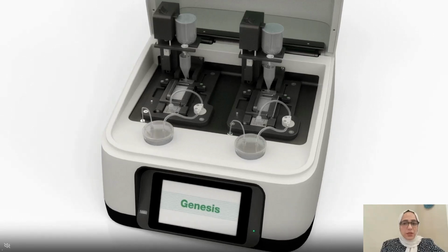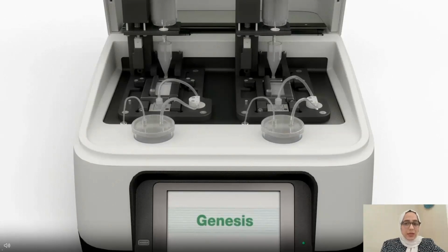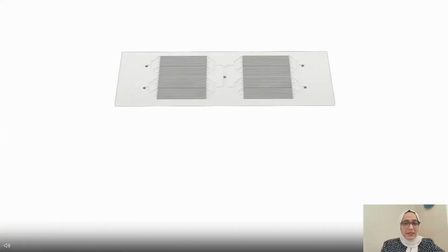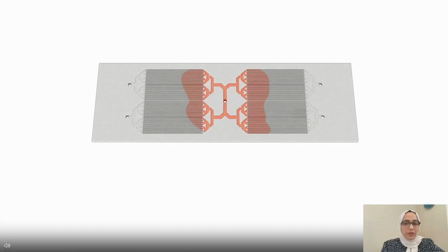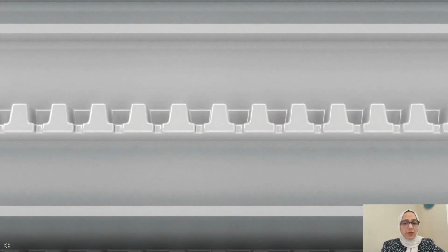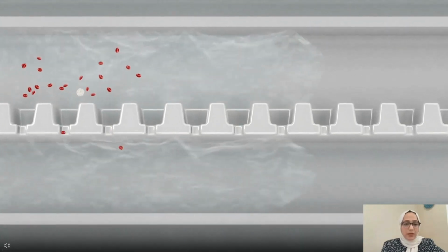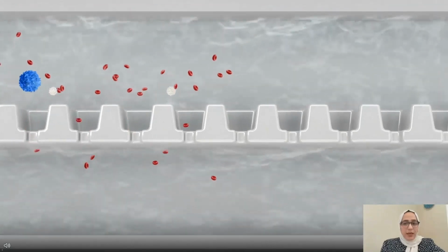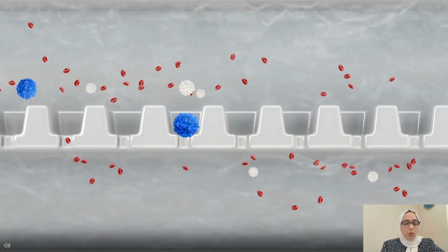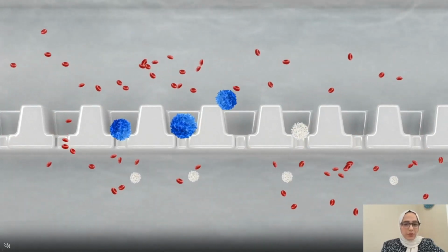The technology enables the isolation of CTCs from liquid biopsy samples, such as blood, as I mentioned, and there are two sample lanes, as you can see, enabling the processing of two samples simultaneously. The CellSelect slide is designed with 56,400 microchambers that capture CTCs based on differences in cell size and deformability, while RBCs and white blood cells, shown here as red and white, are filtered out through the microchambers, while the CTCs, the blue ones, can be captured in the chips.